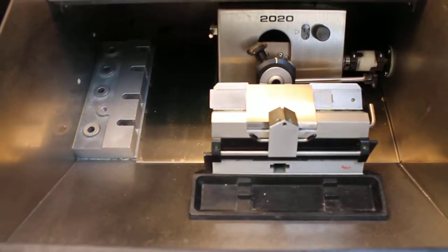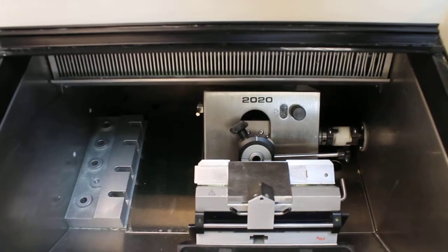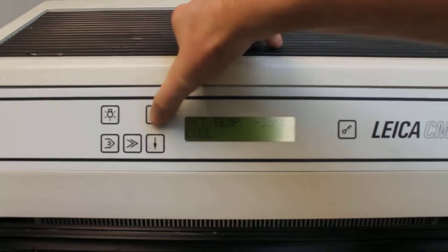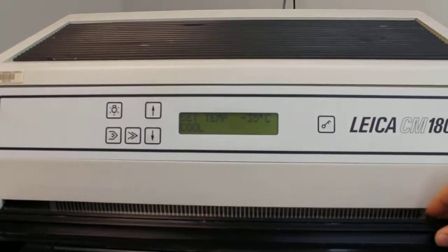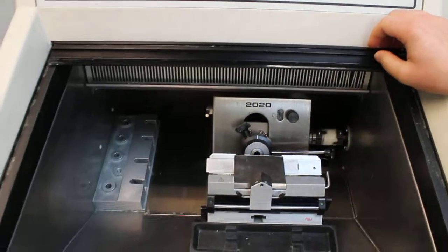You can turn the light on and off. To adjust the temperature, I press and hold the temperature control button. We can turn the temperature up — it goes all the way down to negative 35 degrees Celsius. At this point, I think we're at about negative 18 degrees Celsius, after about a half an hour of cooling.